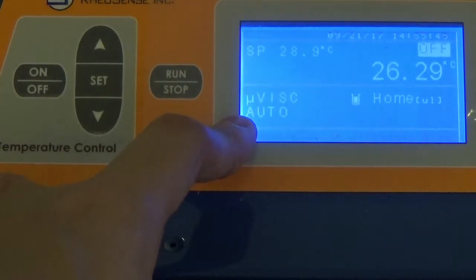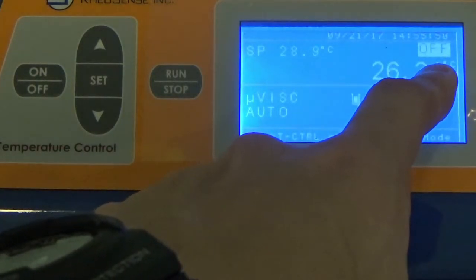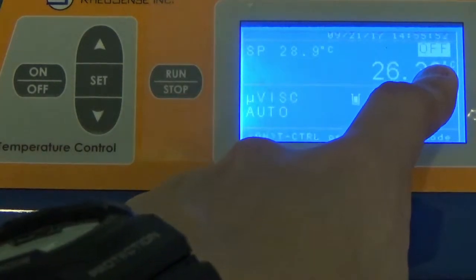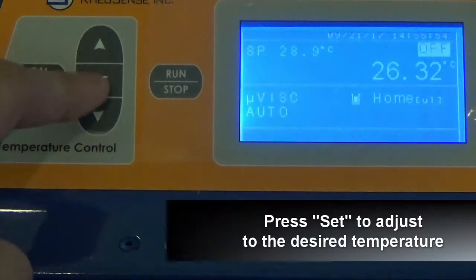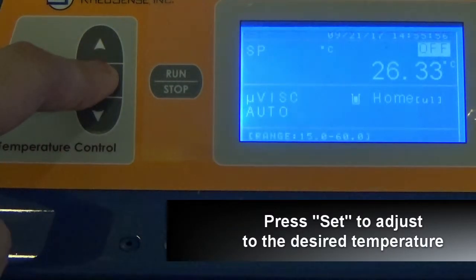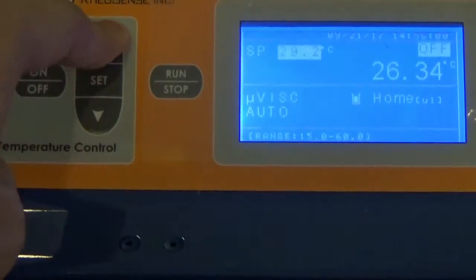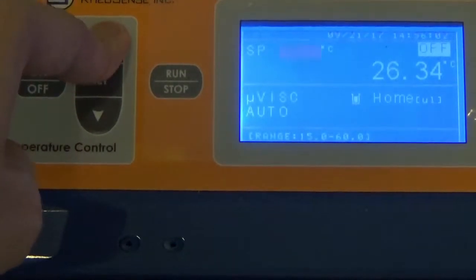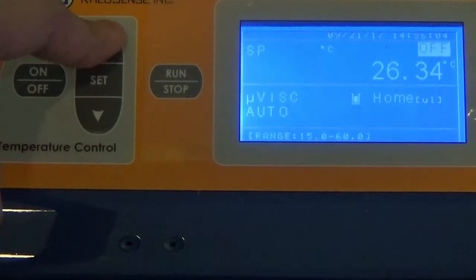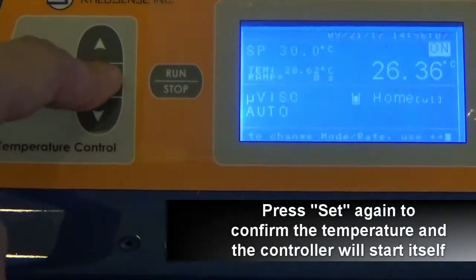The 'off' here means that the temperature control is now off. If you wish to set the temperature, just press 'set' and you'll be able to change the temperature. For example, you can increase it to 30 degrees. When you're all set, just press 'set' again.